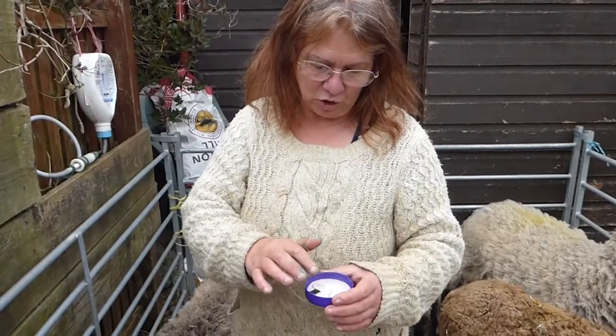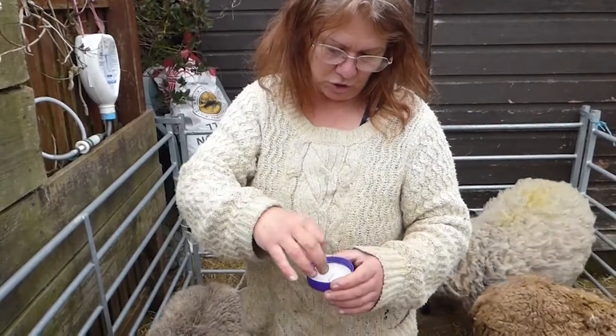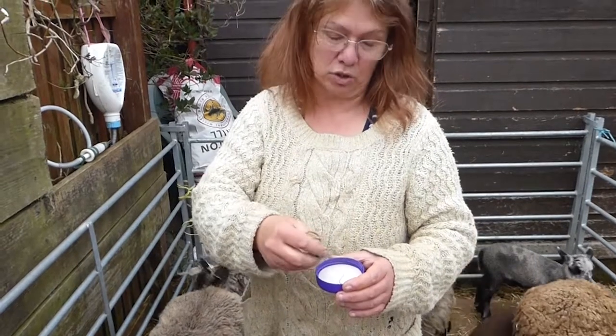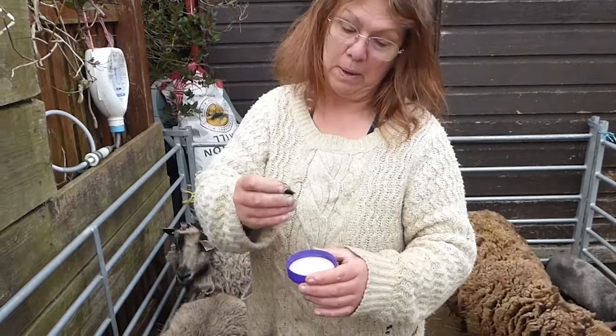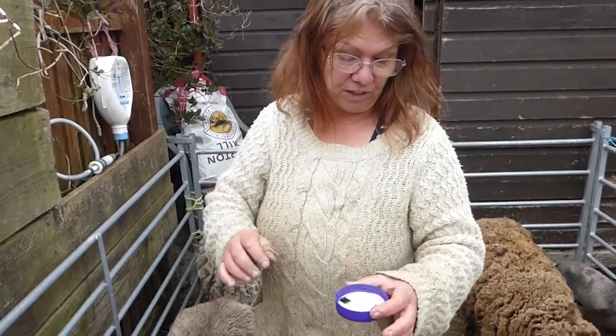Dip them into a solution of alcohol or antiseptic, just to make sure when it goes through the ear that you're trying not to put in any bugs through the ear. So you just make sure that your pin end is dipped in, but they can lie down.